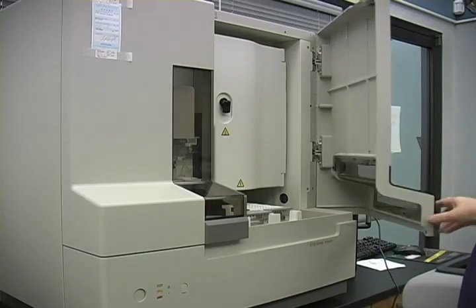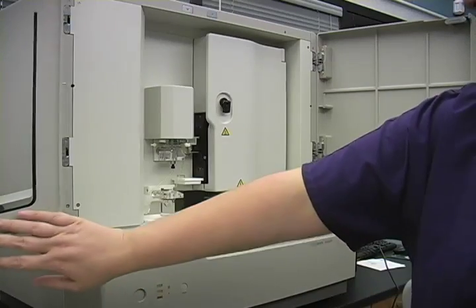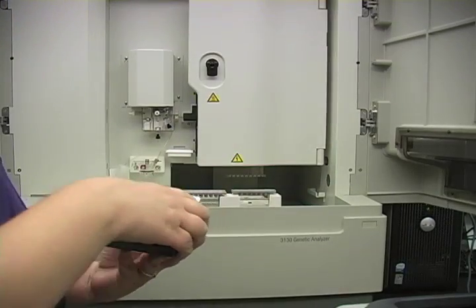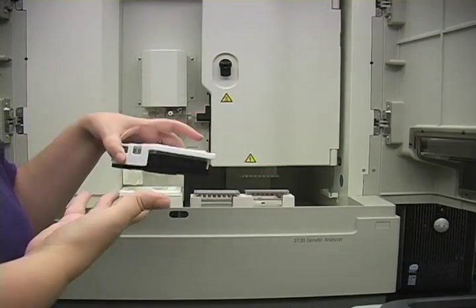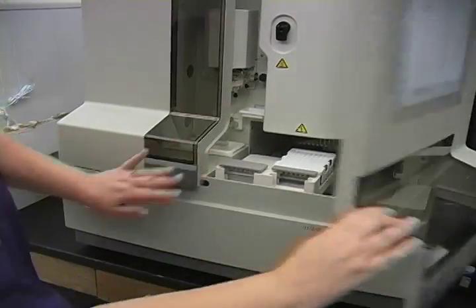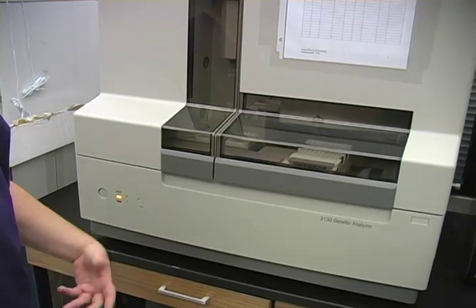This is a 4-capillary instrument, which basically means it can run 4 samples at the same time through different channels. When it's completed running, we have a computer software that will convert what the instrument sees via laser to a data form that we need to analyze it.